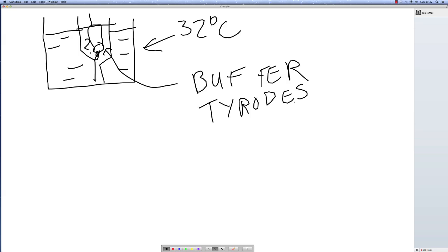What do you think is actually in that buffer? Well, everything that the tissue needs to be able to work. So it contains all the salts, glucose, sodium, potassium, all of the material that it requires to be able to contract. So it can provide energy, and it has obviously the ions enabling it to be able to depolarize the cells and contract. In addition to that, what else does a tissue actually require? If a tissue is contracting, it requires energy. And to get energy, what do you actually need? You need your tissue, your cells, to actually make ATP.